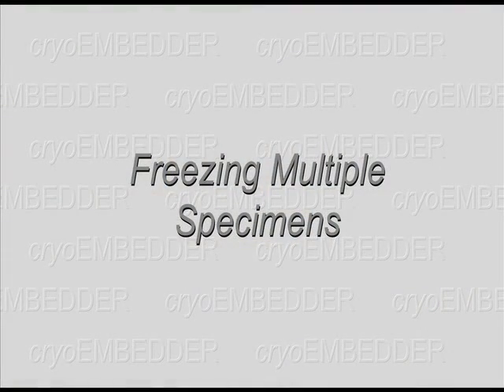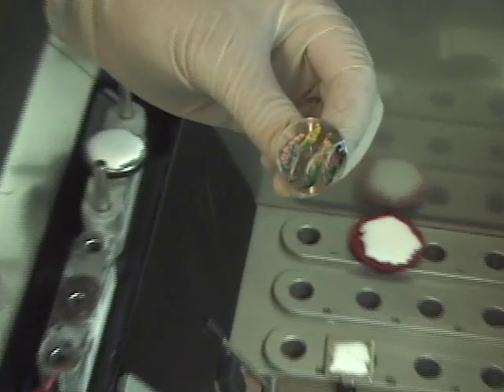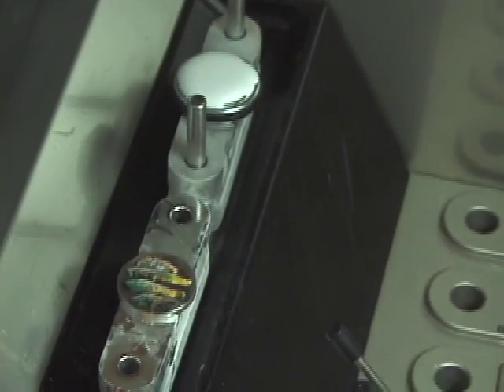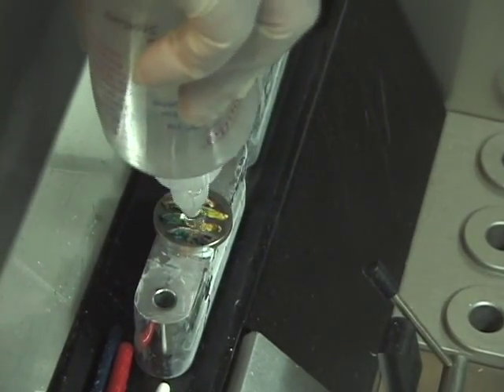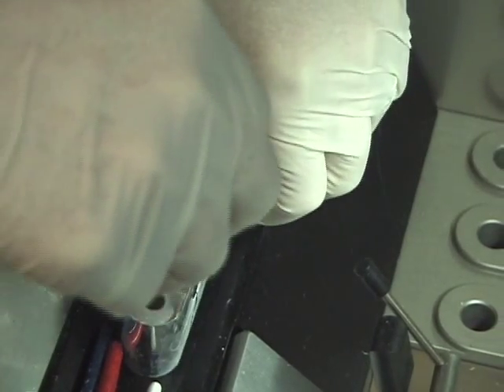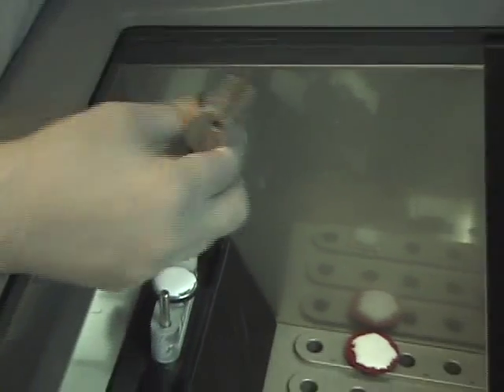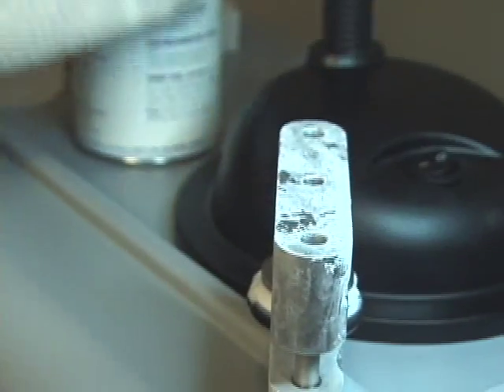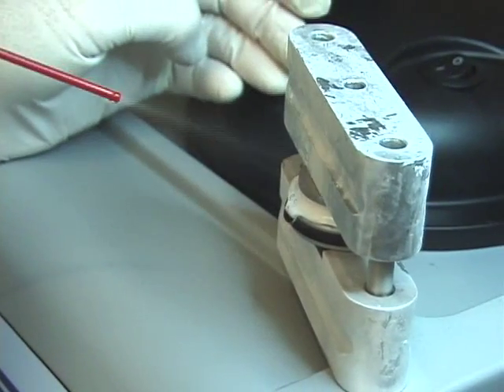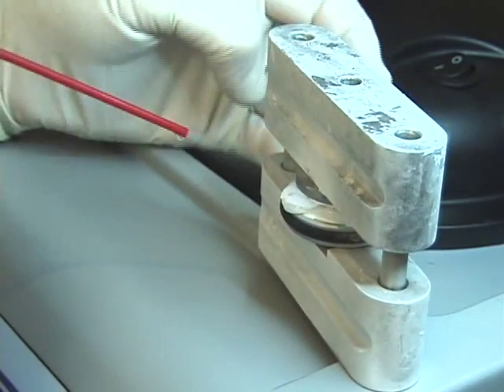Second stages or levels can be time consuming to embed and cut due to multiple pieces. If specimens are mapped and dyed using different colors for each piece, there is no reason they can't be embedded on the same disc — this greatly speeds up the processing turnaround time. All four pieces are marked differently from one another and all are embedded on the same flat plane. They will all be cut together and placed on the slide together, giving the doctor fewer slides to view, fewer slides to stain, cover-slip, and file, but most importantly, the patient will have a shorter wait.